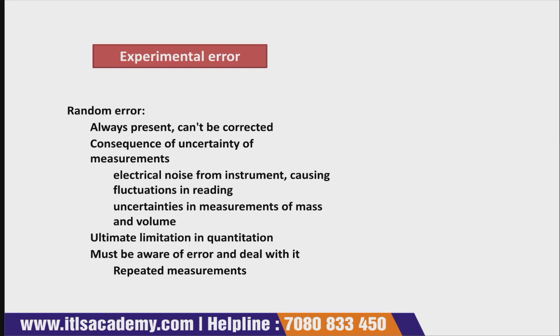Whenever you find an error and know which side it is coming from, you must take some preventive steps before using that technique. You should take certain steps to avoid those errors. So these are the experimental errors.